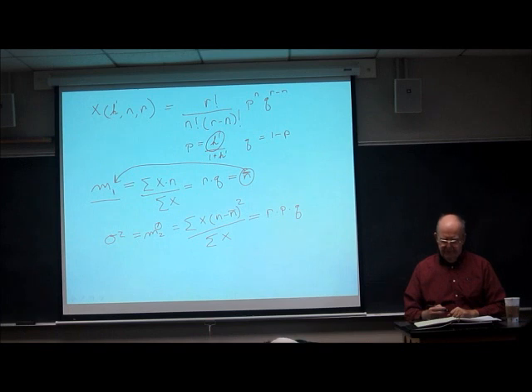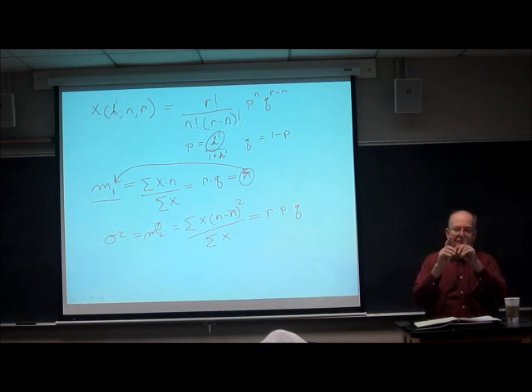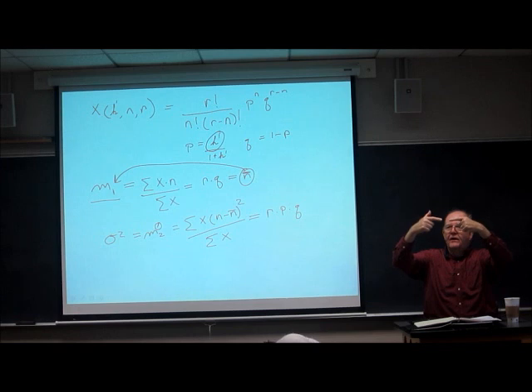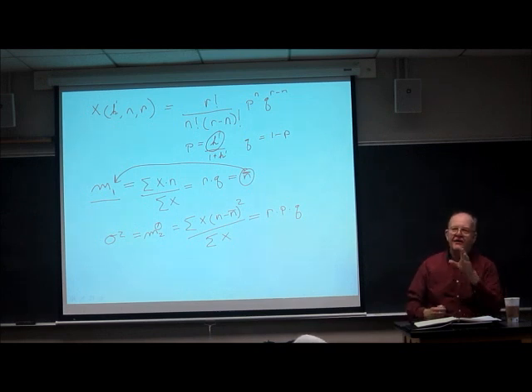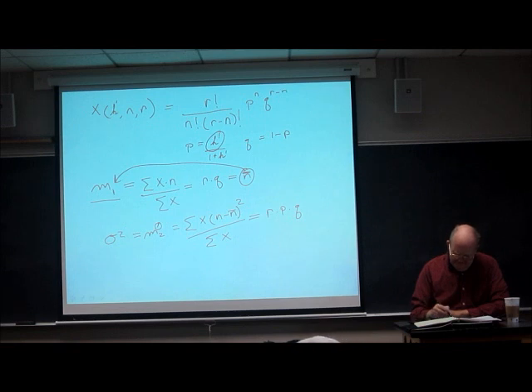Good. So is n bar the tube number at which the center of gravity is? It is the tube where the center of gravity is located. And in this distribution there is the zeroth tube, the one tube, the second tube, the third tube. And so n bar, because it's an average over the distribution, may not work out to be exactly 3 or 2 or 1, because the mass is not all located in one tube. It could be in the middle. You've seen plots where the two points were equal height, the 1/8, 3/8, 3/8, 1/8. It's somewhere between the 2 and 3. So it's not going to work out to be an integer all the time. Okay, very important point. That's the first power.